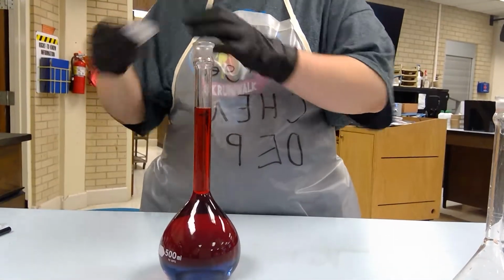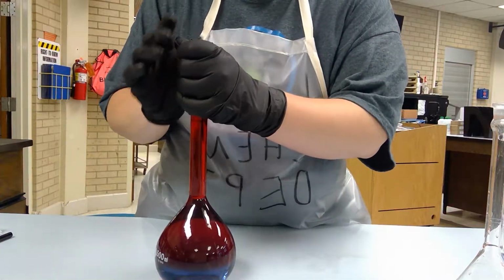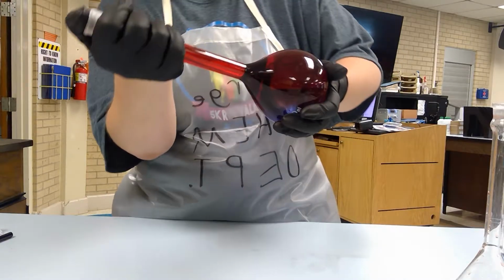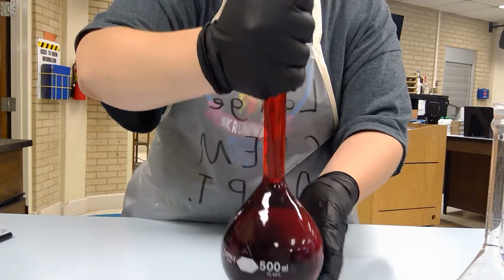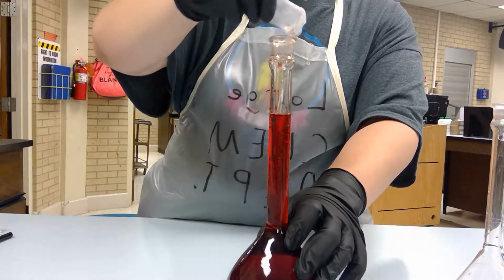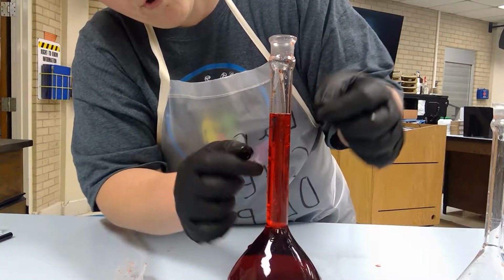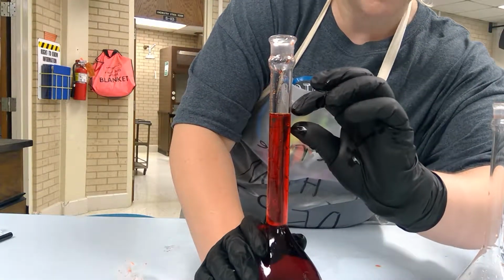Okay. And just for good measure, to make sure everything did go okay, I am going to go ahead and mix this to ensure that this chemical reaction has happened. So I'm going to get a good seal on that. So I did a quick little mix there, but you can see that here's my 500 milliliter line, and my volume is now above that line. So I've got that much of a height difference.